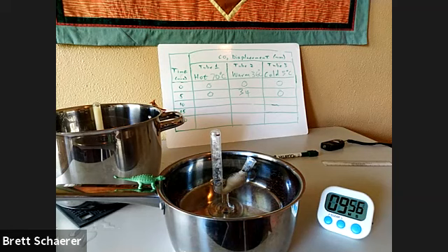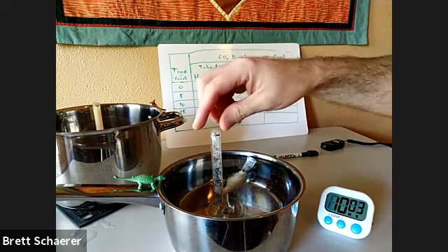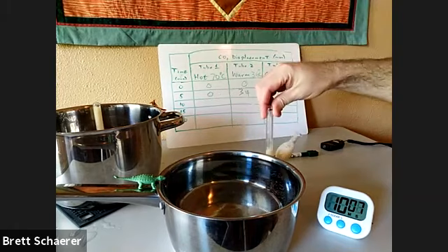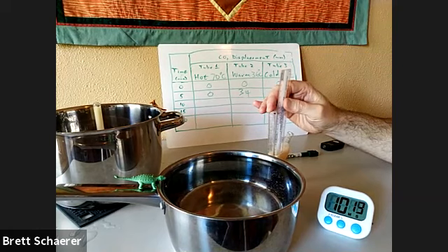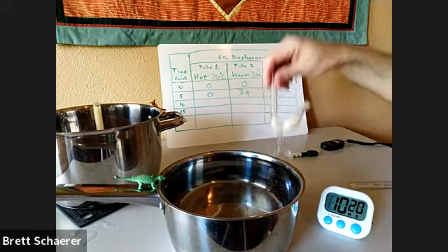Okay, we are coming up on the 10-minute mark, and we will again start with tube 3, or I'm sorry, tube 2, the warm one. That is going very, very quickly, and in fact, I have to take it out to even measure it. Looks like, say 79 millimeters.